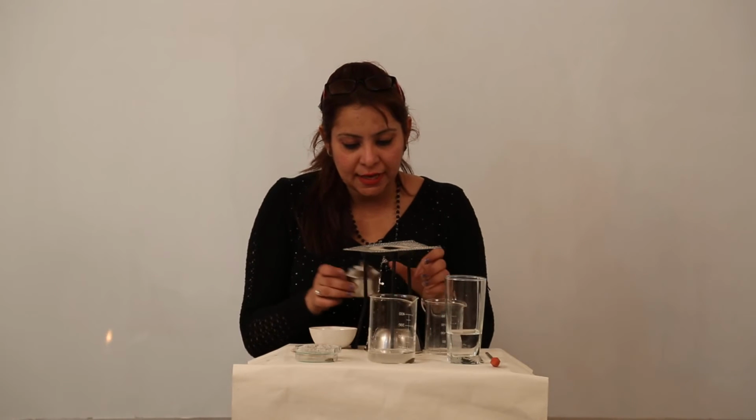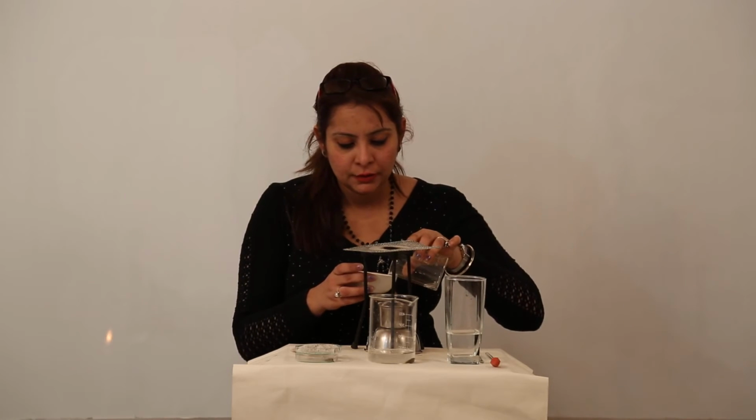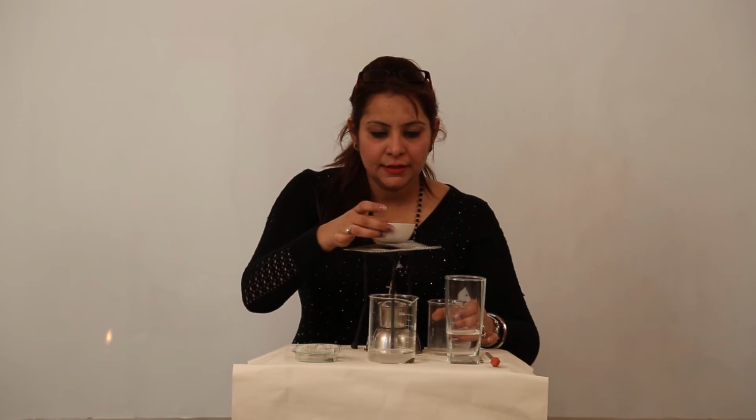Just to adjust its size, I have kept something below it like this, and I am just taking this mixture into the china dish and just keeping it and just lighting the lamp.